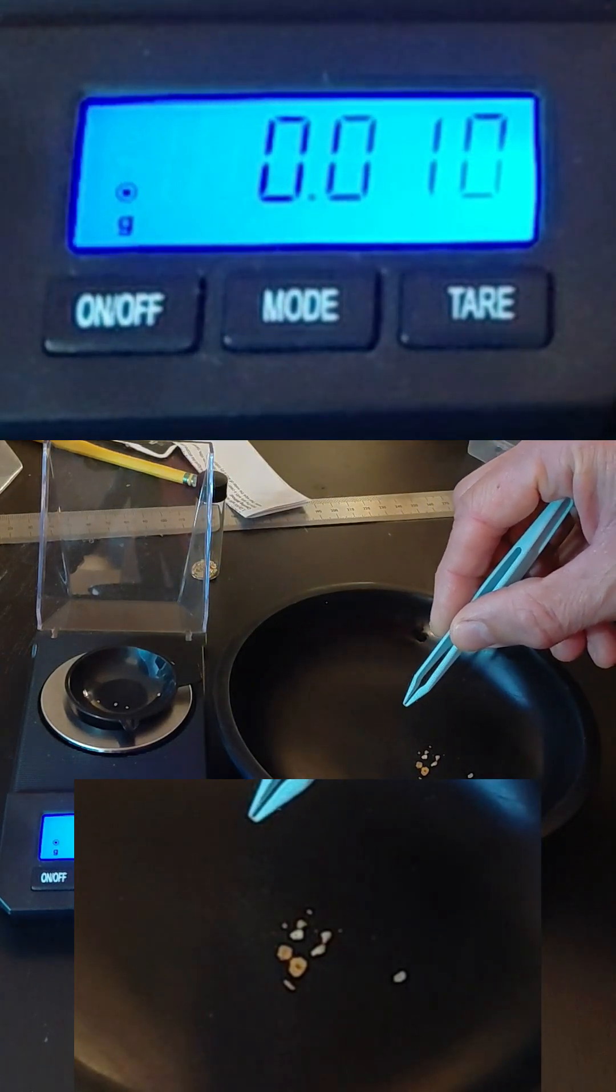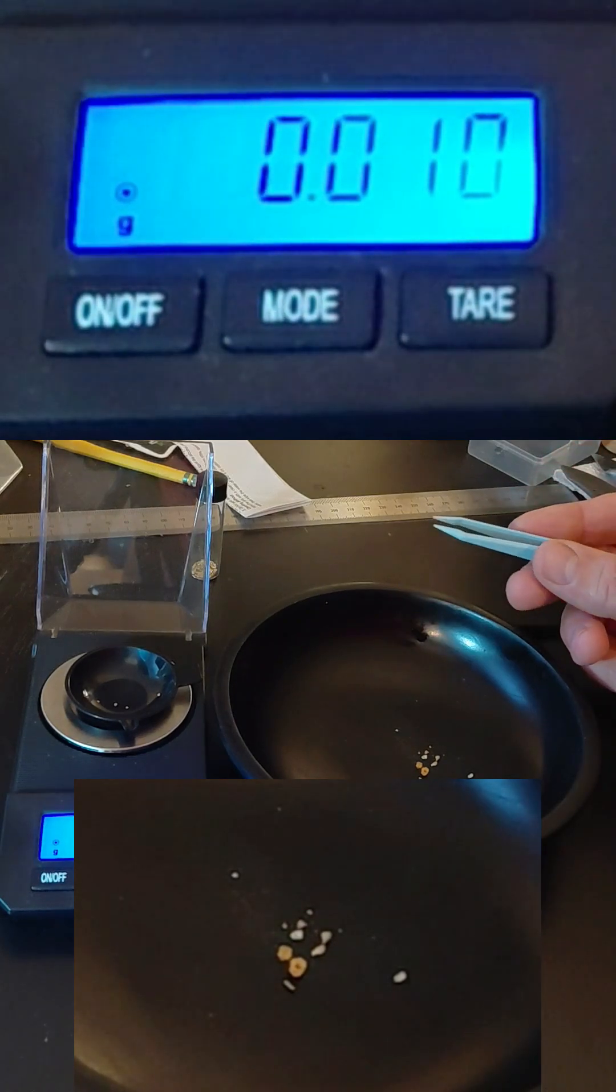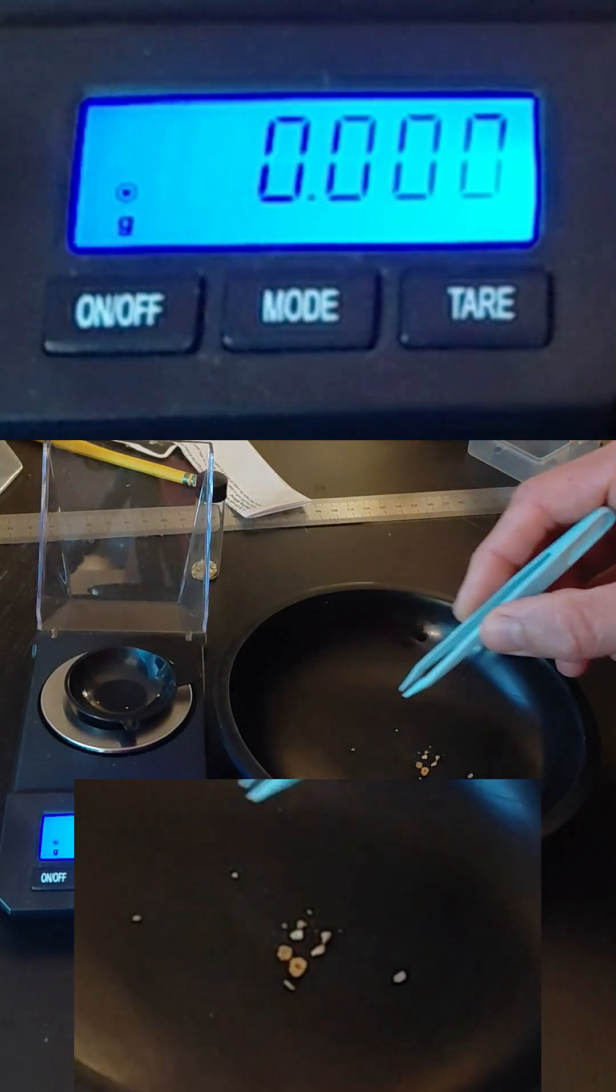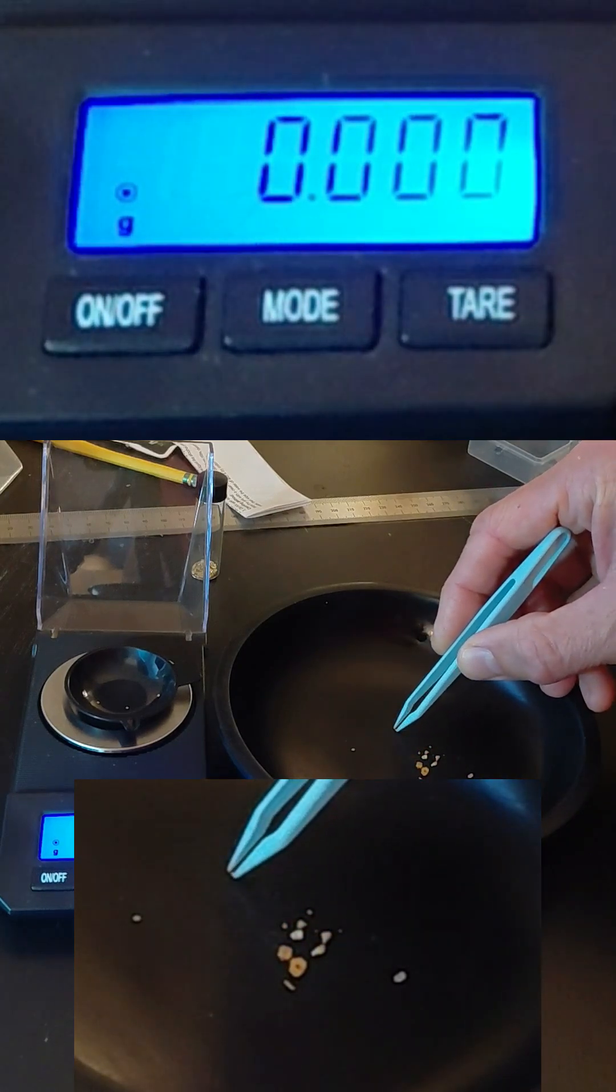Yep, it jumps from zero to 10 milligrams. I'll take this one out and we'll see what. Okay, I'll put a smaller one in.